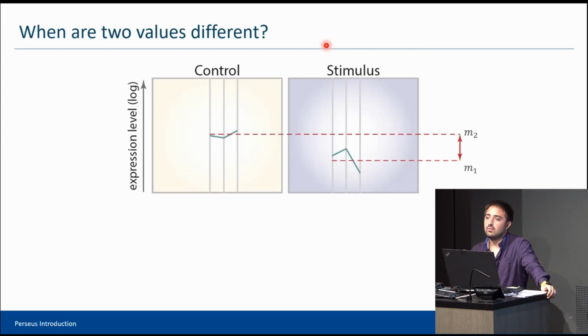Then there would be no mapping happening. So we usually do the mapping with the proteomics identifiers as the base, and then to each proteomic identifier of a protein group, we take the majority protein ID. We map then whatever fits from the transcript IDs, basically. And if there's no fitting transcript ID, then it would be empty.